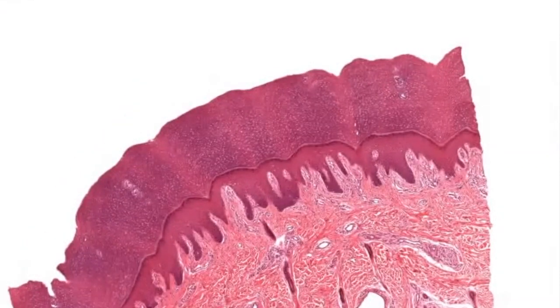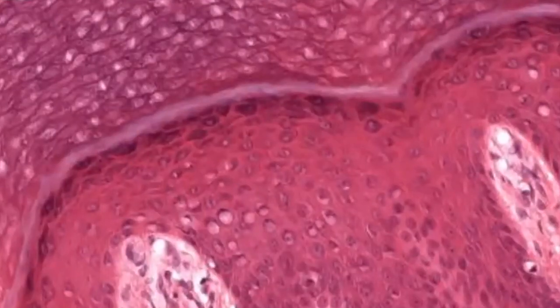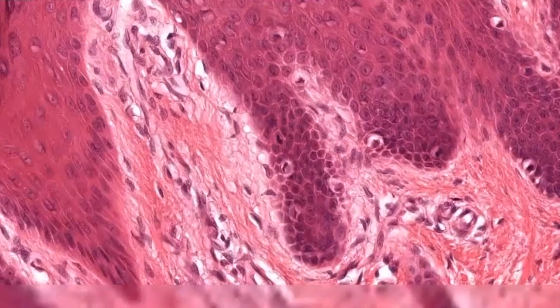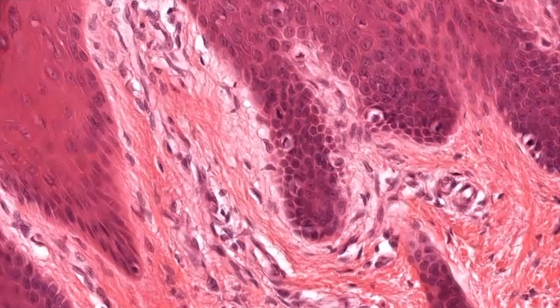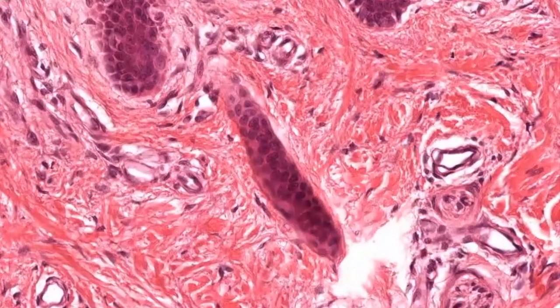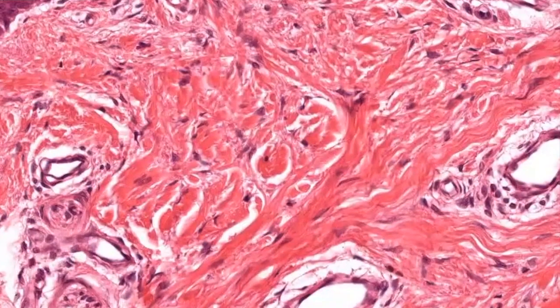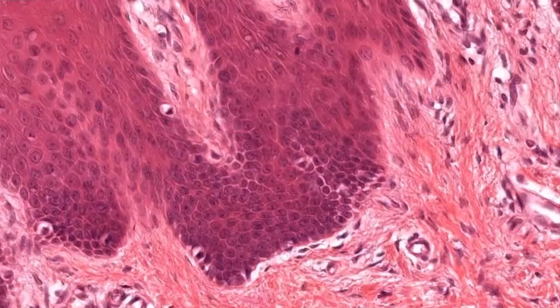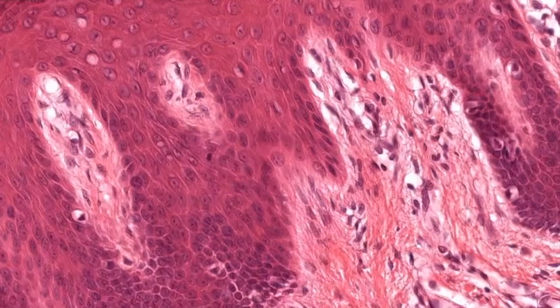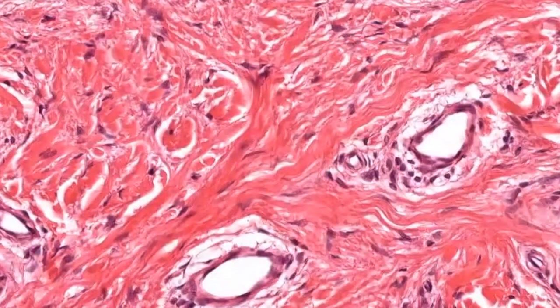Here again, here's that epithelial layer. You can tell the different color even from far off. And then these are all the individual cells. And you see how these are all the fibroblasts. You see how the strands are kind of like a single strand. Then as you go deeper, those become bundled up, right? So this is all collagen, but the arrangement between the two is a little different. This is a looser arrangement. There's fewer of them, and they're not in bundles. So this is dense, irregular connective tissue.